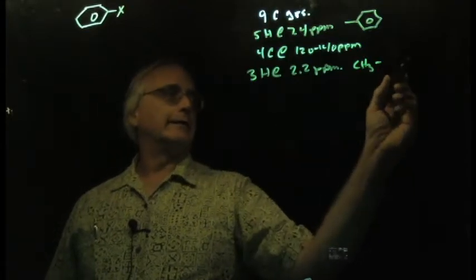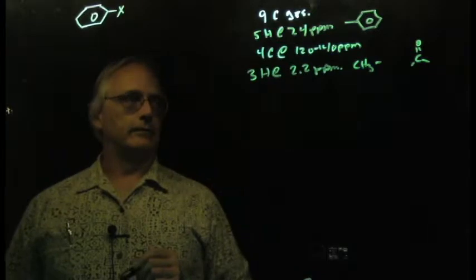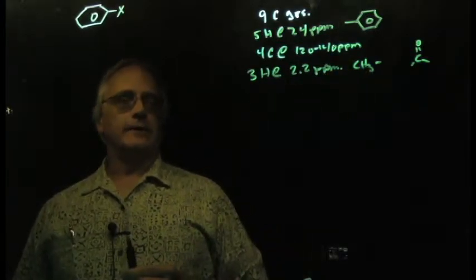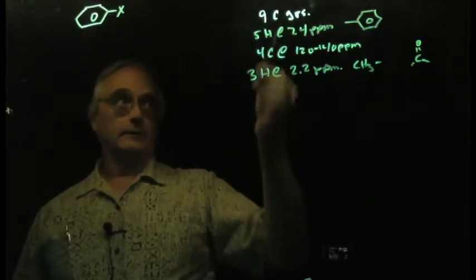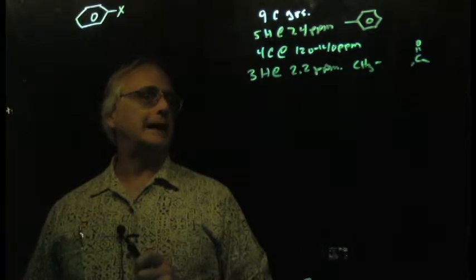The interesting thing could be a carbonyl, or it could be the benzene ring. Now, to stick the methyl group here at the end of the benzene ring means the molecule's done. And clearly the molecule's a lot larger than that. So I'm going with a carbonyl possibly.